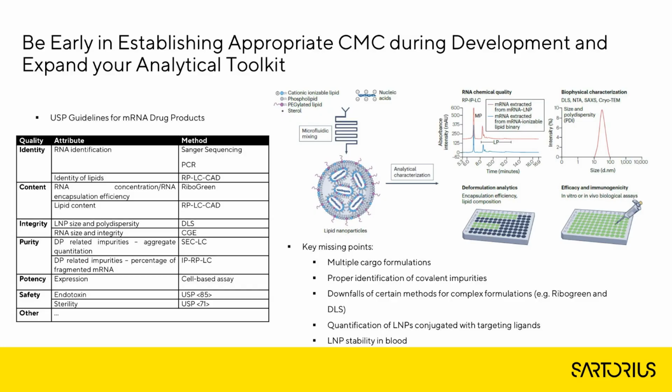Now, those are a slightly limited type of methods. As we progress toward a more commercializable product, through different cycles of optimization, manufacturing development, and releasing of such drug products, we will need to expand this analytical toolbox to truly cover all the bases and all the characterizations we need to properly predict how our drug product is behaving. I will just mention a few key points I believe are missing right now.